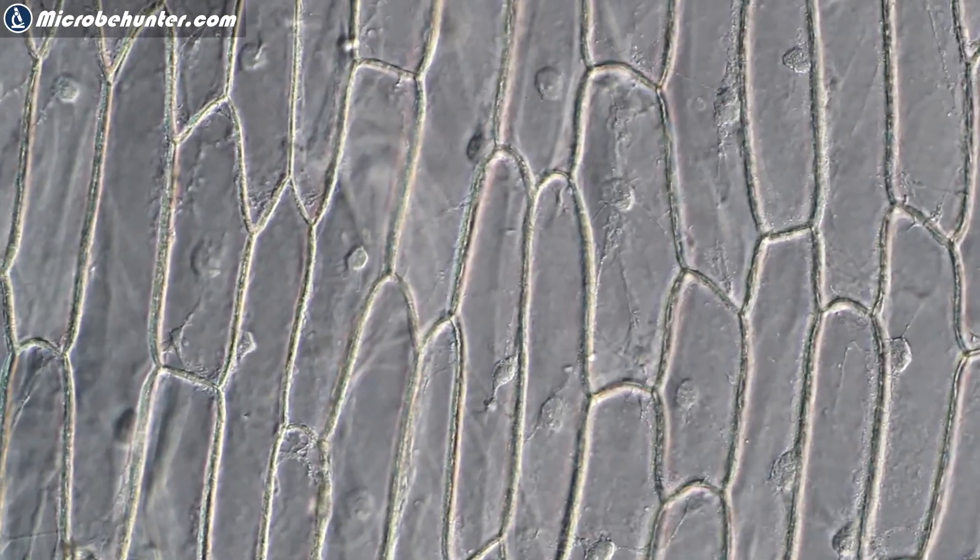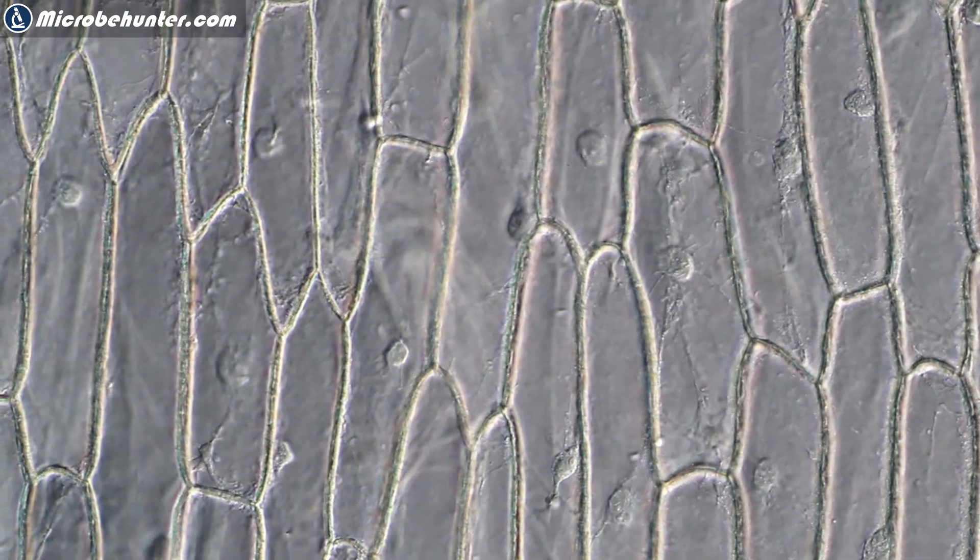Hi, Microbe Hunter here. Today, for a change, I'm not going to answer questions from my viewers, but rather I'd like to give you a short tutorial on how you can improve the videos that you make using your microscope. Specifically, I'm going to show you how you can make very smooth pans using your microscope.